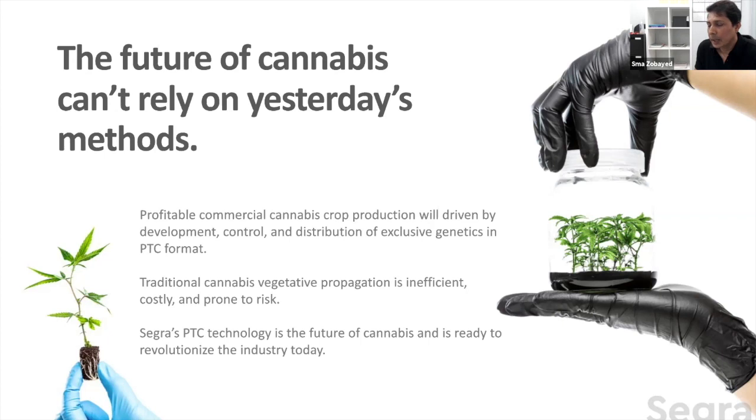But I can say in general we use a ratio of cytokinin and auxin. We develop these protocols by combining different auxins and cytokinins with different nutrient supplements, and we established 3 to 4 different growing media for the multiplication phase, and 1 for initiation. So some varieties, when they come, they all go through the first one, and then for initiation they transfer to priority 1, 2, 3, wherever they should.